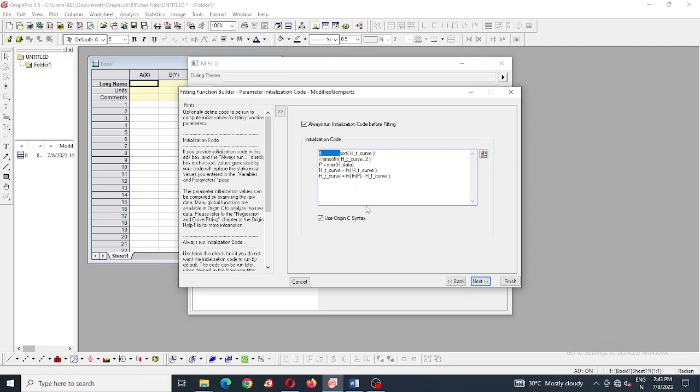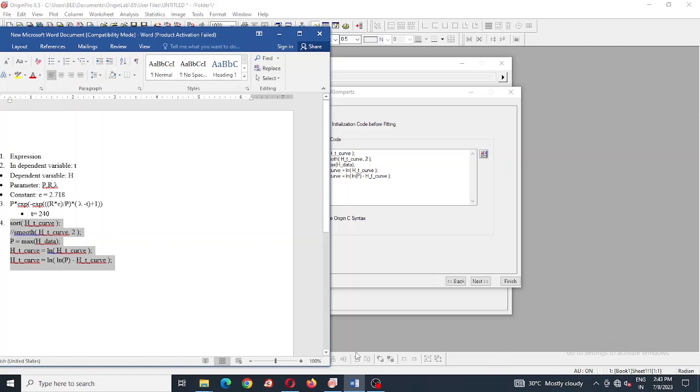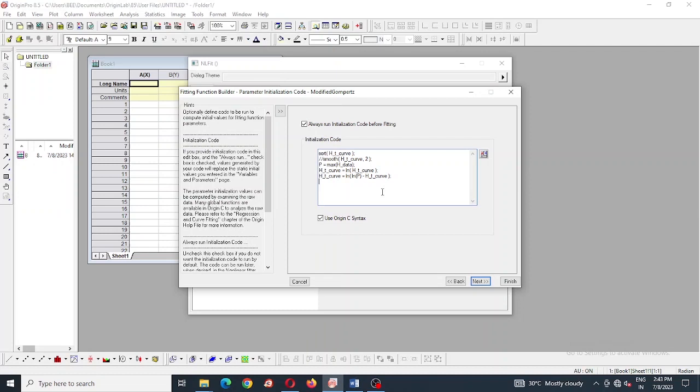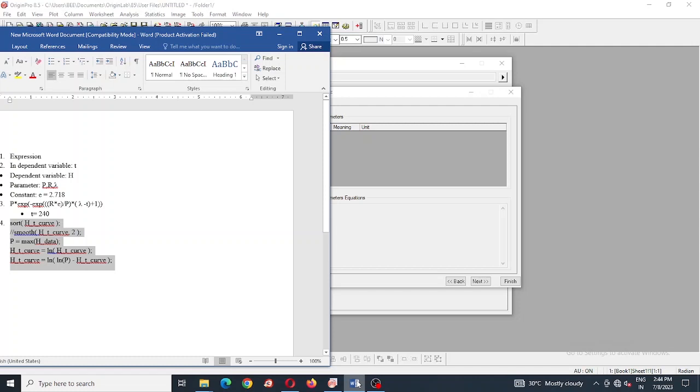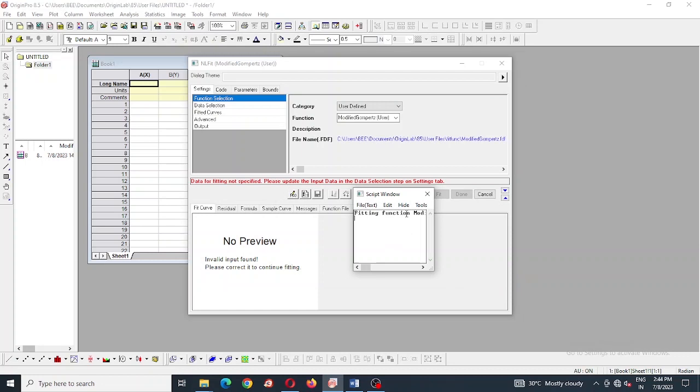Then press next and copy this function and paste it. Without using this function, it also works. At last we have finished the function, we have created a modified Gompertz equation successfully. Then we are going to put data in a sheet, which is in origin.